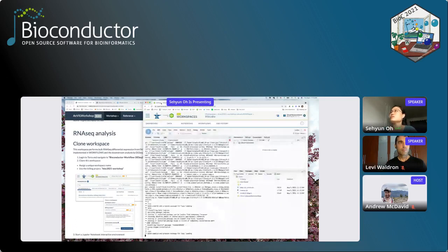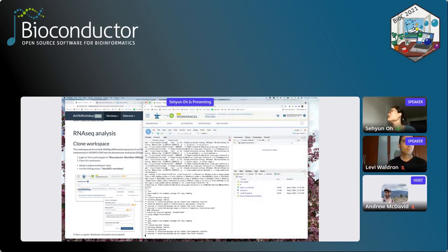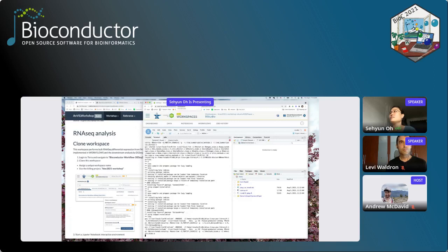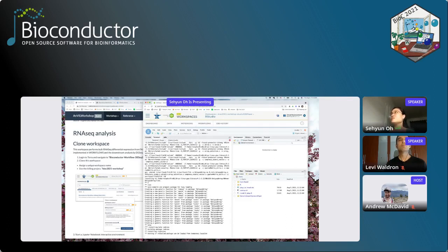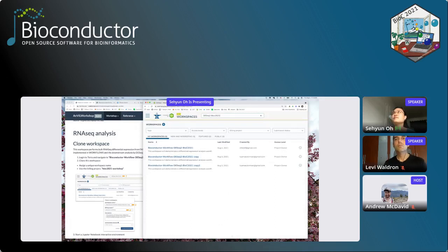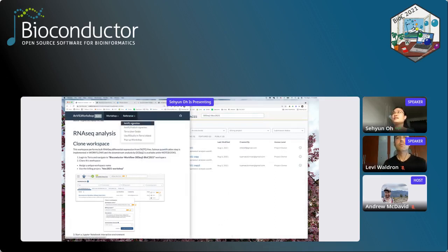Okay, it's running. We have only 10 minutes or so. I think we will see how this script runs. So this is just an example, but the take-home message from here is how to start RStudio, and then from there you can do a lot of things. This is one of the things you can do, and all the other things, or even accessing the data from your workflow from this RStudio session, is available using our AnVIL package, which I put the vignette link to under reference in our workshop page.